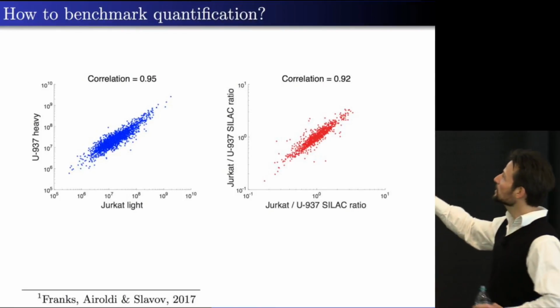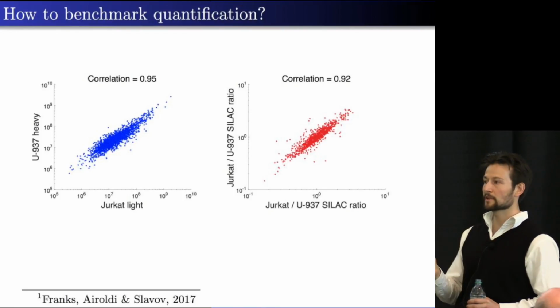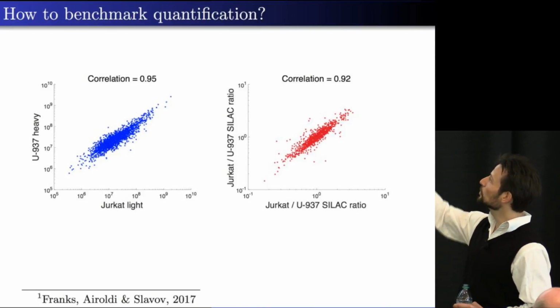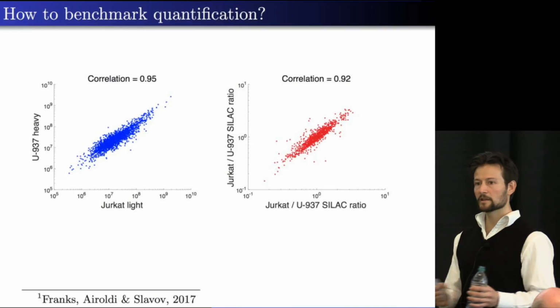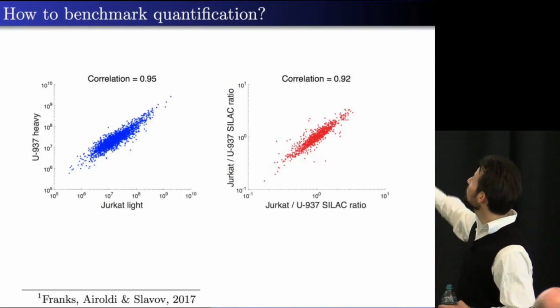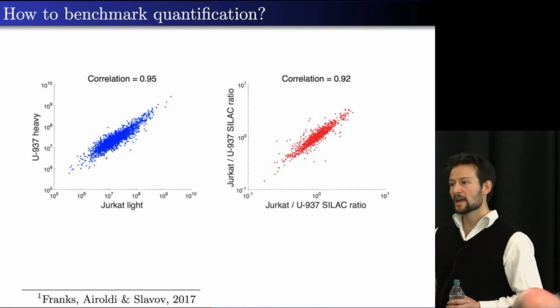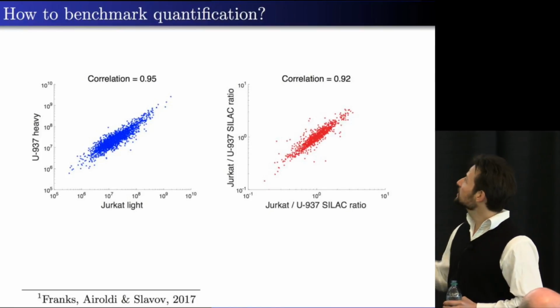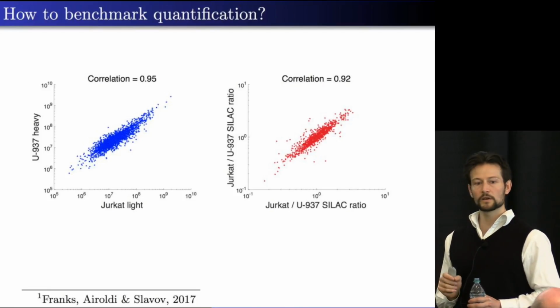So what I have done here is I just take the ratios between corresponding peptides. Instead of plotting them on this log-log space, which has many orders of magnitude and that compress the relative differences, I just plot the relative differences into a 2 order of magnitude space. And what we can see is that these relative differences are remarkably consistent from SILAC quantitation.